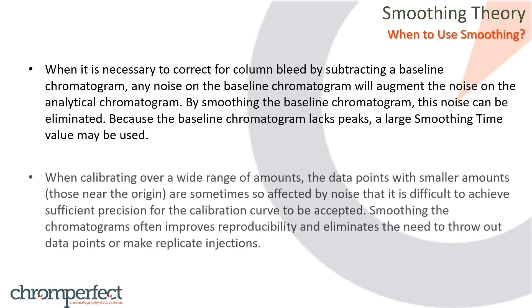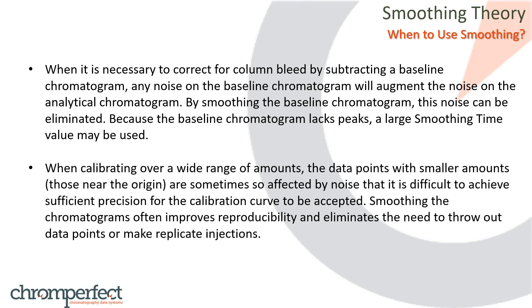When calibrating over a wide range of amounts, the data points with smaller amounts, those near the origin, are sometimes so affected by noise that it is difficult to achieve sufficient precision for the calibration curve to be accepted. Smoothing the chromatograms often improves reproducibility and eliminates the need to throw out data points or make replicate injections.